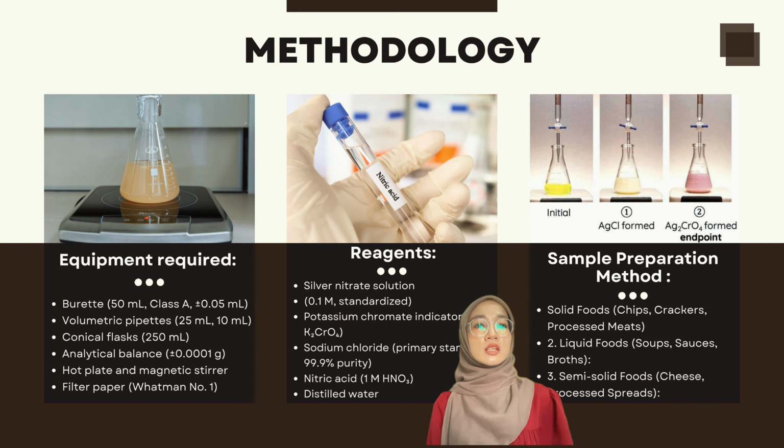Second, preparation method for liquid foods such as soups and sauces. Since sodium is already dissolved in liquid foods, minimal preparation is needed. Simple dilutions reduce matrix effects and bring concentrations within analytical range. pH adjustment neutralizes acidic samples that might interfere with sodium measurement techniques like flame photometry or ion selective electrodes.